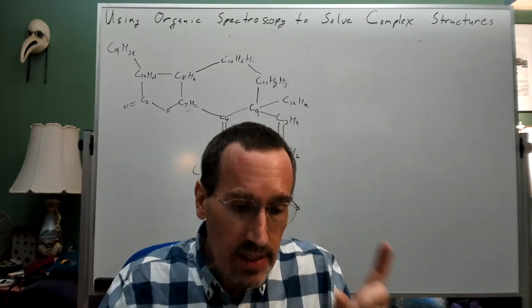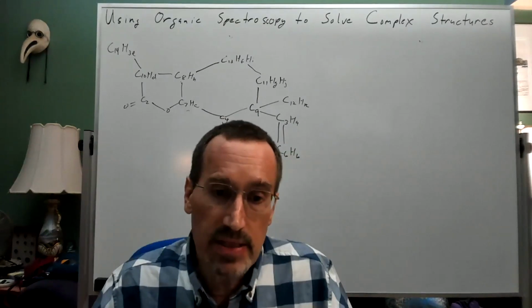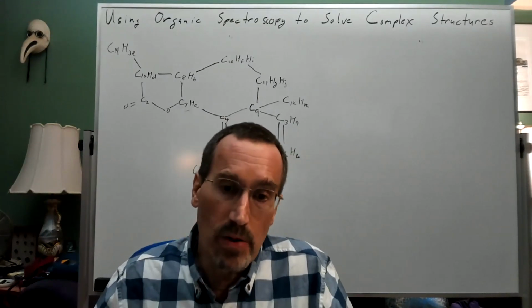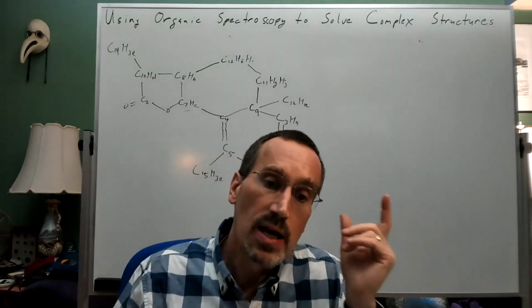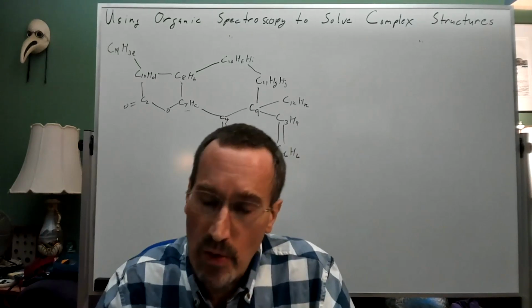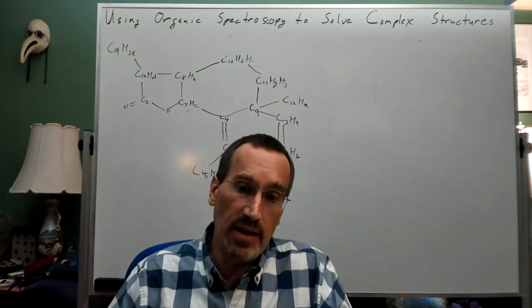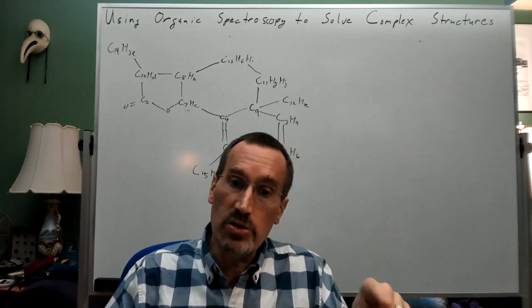We used HMBC to stitch the pieces together. Most notably, we were able to stitch in the carbonyls, the allylic methyl group, and very importantly, that isolated aliphatic methyl group that served as a linchpin.